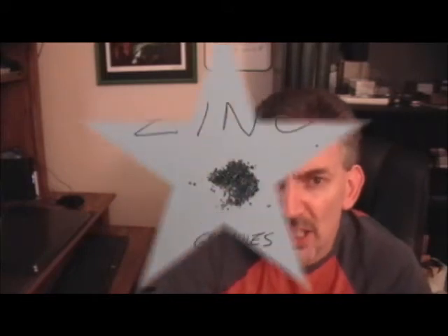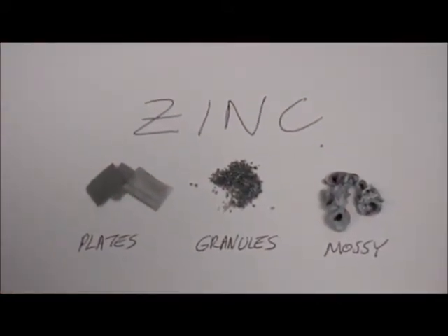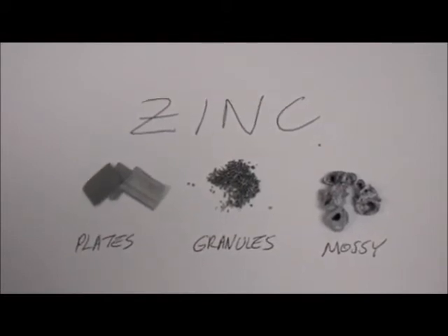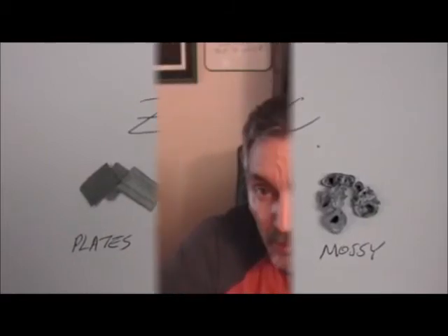You'll also look at the effect of surface area on the experiment. We have got 3 different kinds of zinc. We've got plates of zinc, we've got granular zinc, and we've got mossy zinc, which is a kind of porous kind of zinc. And we know that the surface area to volume ratio is important for the rate of the reaction.